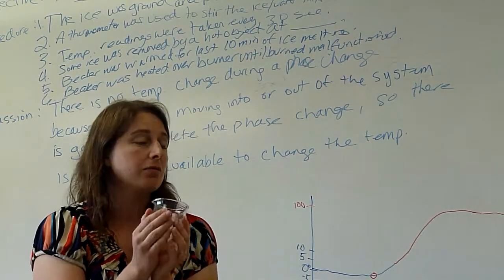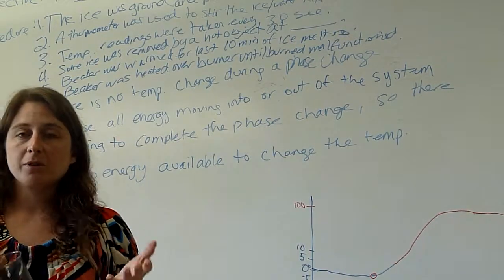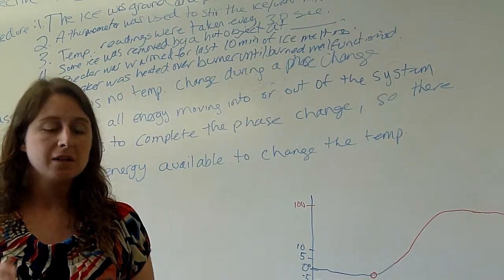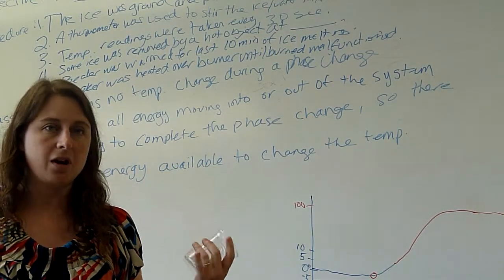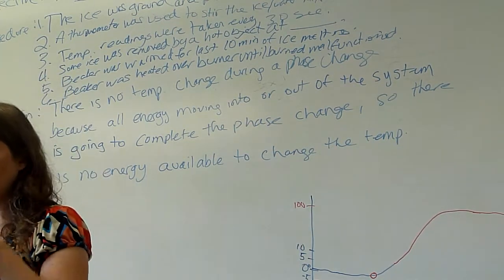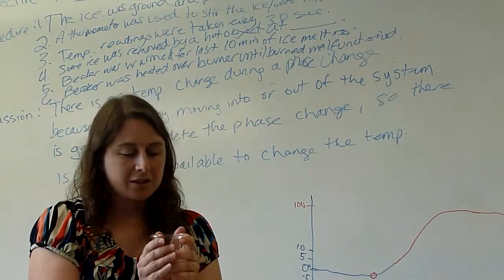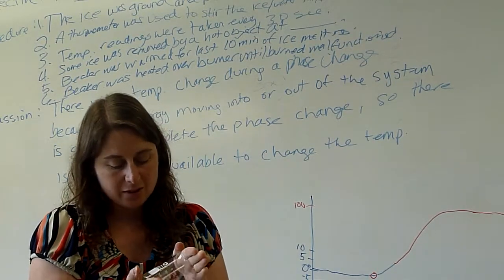You'll have a styrofoam bowl, because styrofoam is a great insulator. In calorimetry, the whole goal is to insulate your system from the outside environment so that no heat can get in or out. That's why we use styrofoam for coffee cups, right? We don't want to lose all our heat and end up with cold coffee. We're going to keep all the heat in that we have. So we're going to conduct this experiment inside a very insulated system. We're going to keep it as insulated as possible.